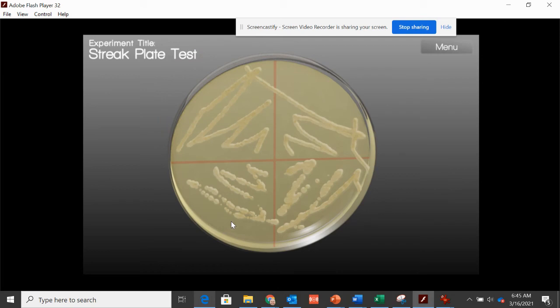And look what you got. I did okay, right? Definitely not any isolated colonies here. Oddly enough, I got an isolated colony there in my third quadrant, and I've got some in my fourth, but I probably still dragged across too many here. If it were me, I would probably pull from this when it comes time to grow this thing.